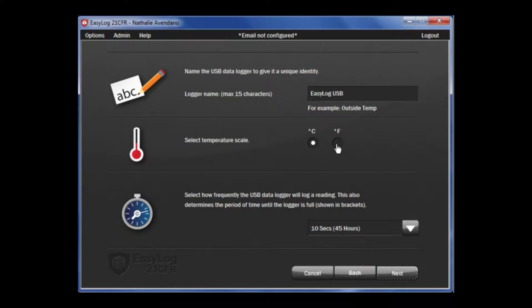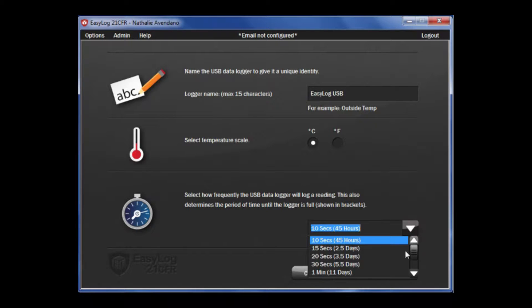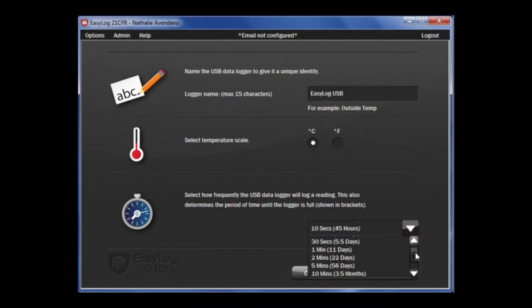Next, you can choose between degrees Celsius or Fahrenheit. And then, you have to choose how often you want the logger to take a recording. You will note, with these options in brackets, it shows how long it will take the data logger to fill up with data.